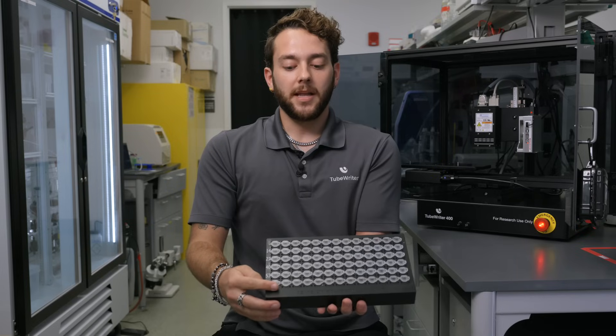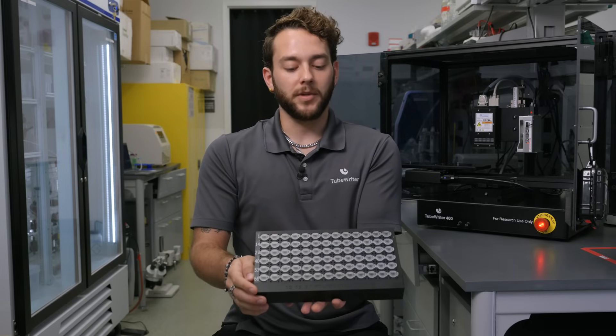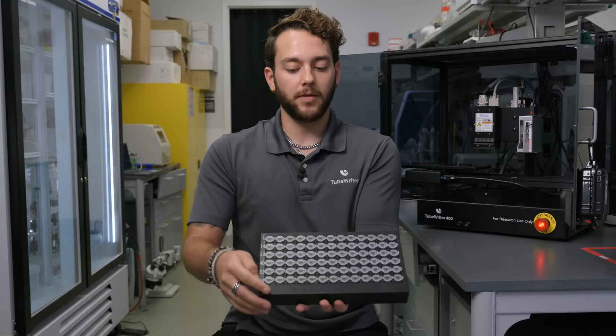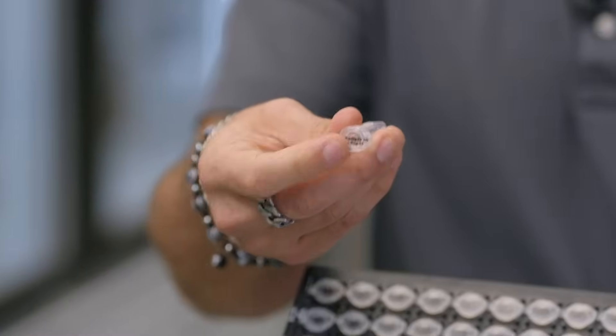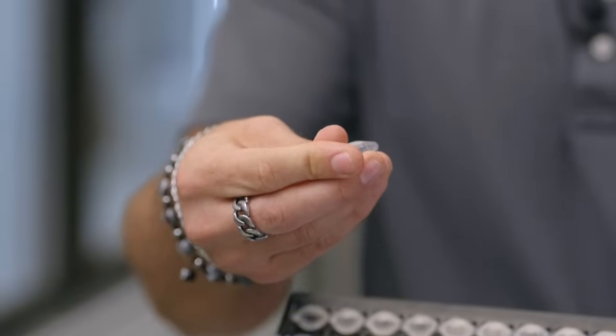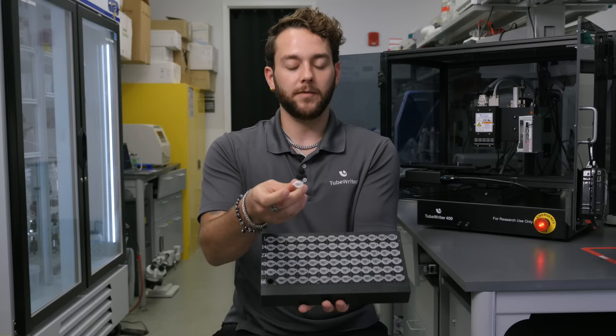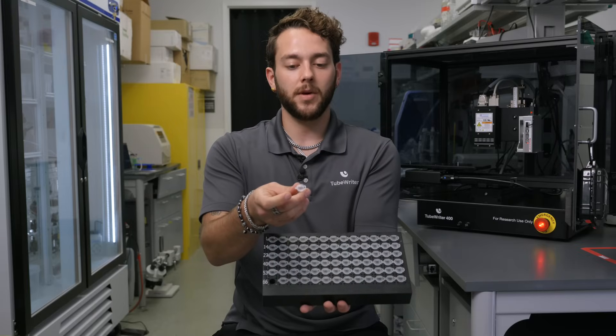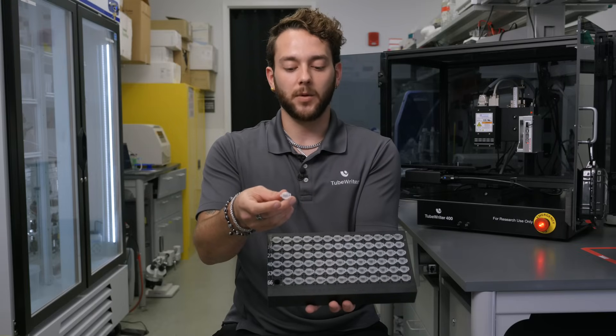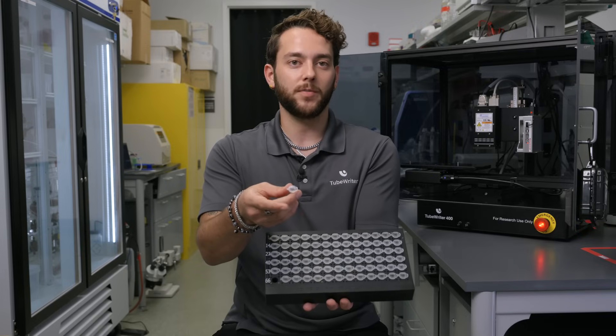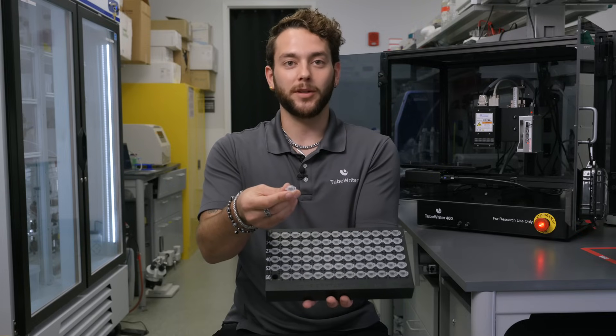You'll see that all of them have been printed nicely and you've got great print quality. I'll take one out and rub my finger across the print. You'll see that the text is fully cured onto the tube because that UV light baked it on just as well as it would if we were using standard mode. That's fast mode with the TubeWriter 400.